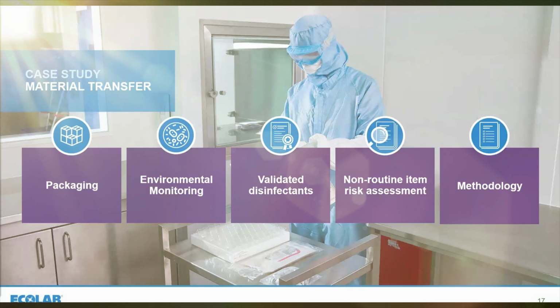And then also we need to think methodology-wise. Tim presented the different types of material transfer processes, from the automated through to the manual disinfection steps. So if you are performing manual disinfection, how are you going through that process? We know it's really key that a disinfectant is in contact with the organism that it's trying to kill. So making sure that you are appropriately treating all of those items that go through that transfer process.